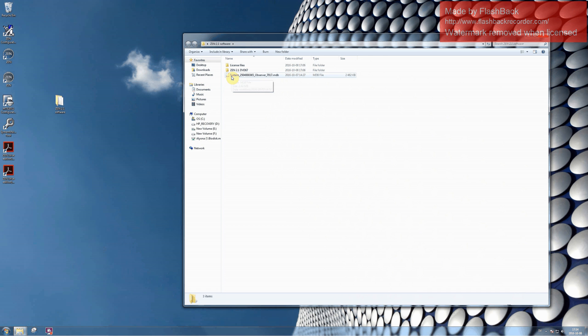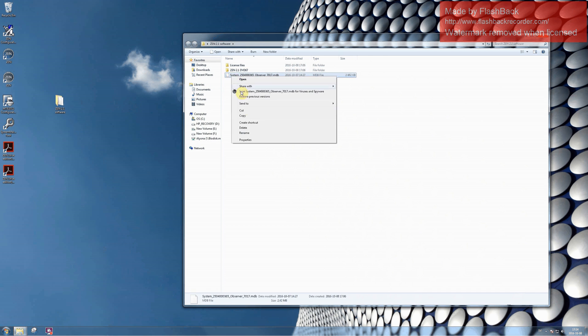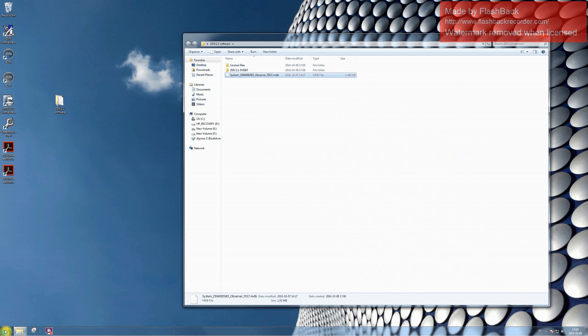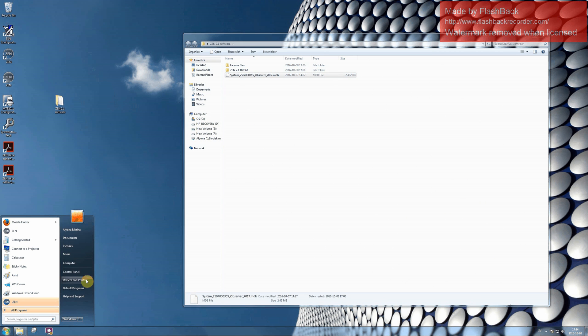Here you can find the file with the configuration. Please copy it and paste it into the folder with the configurations.